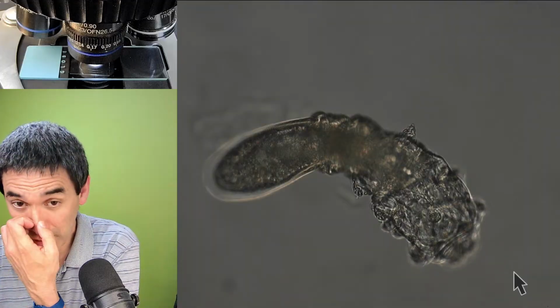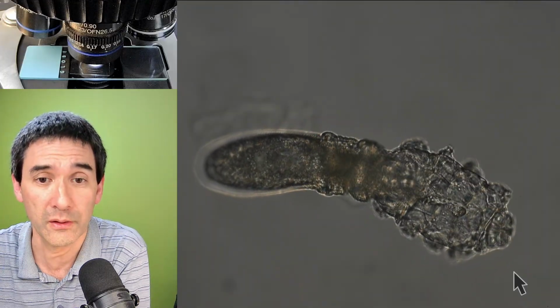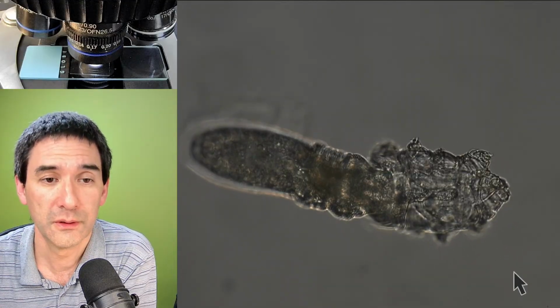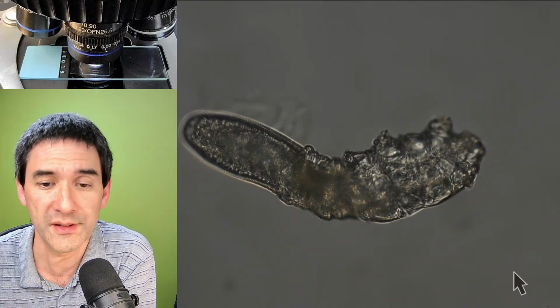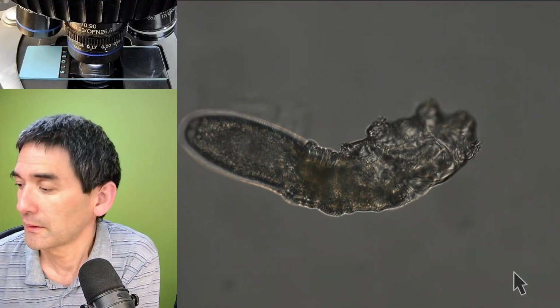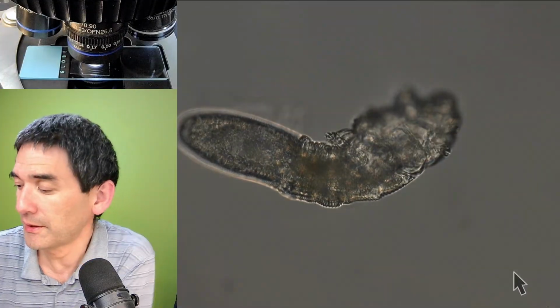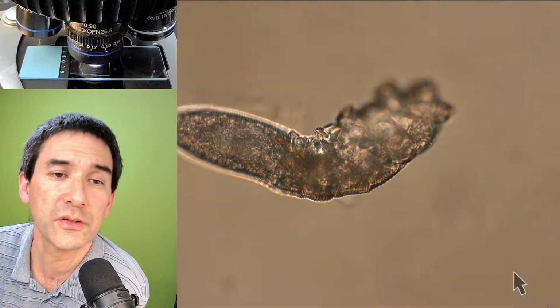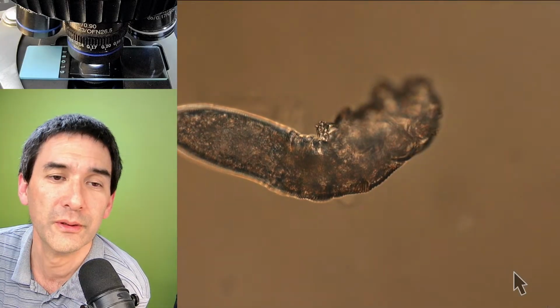Those two have actually been alive now for a couple of hours in the oil. And in the past I've seen all sorts of them already, the larger ones, smaller ones. So let's, but yeah, DIC, but it's interesting if I change the colors a little bit. It doesn't really, it's just playing around now.